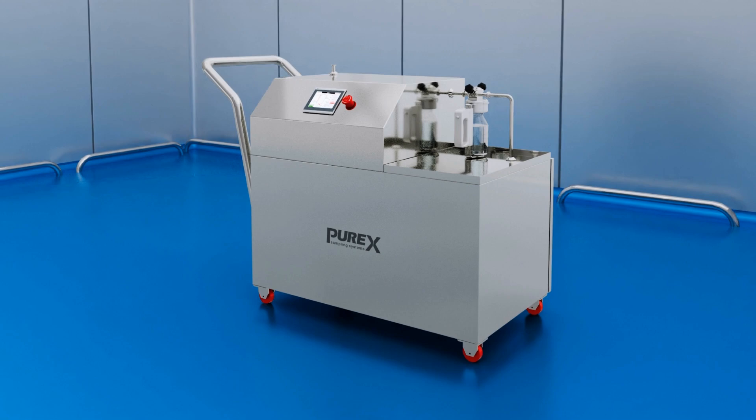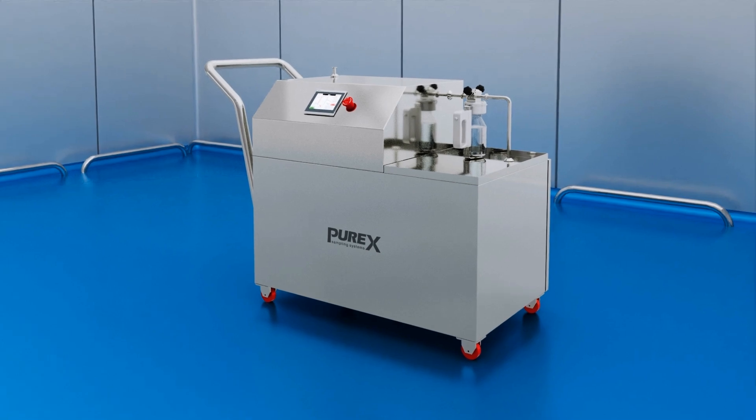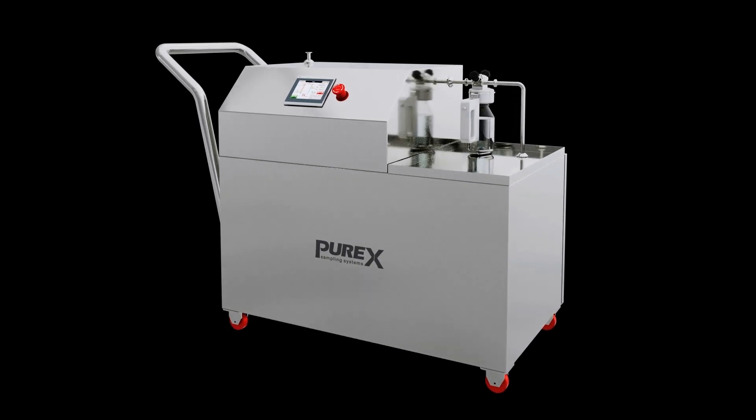The Purex Clean Steam Sampler is built specifically for operation in pharmaceutical clean-room environments. Its ergonomic design is safe and portable.